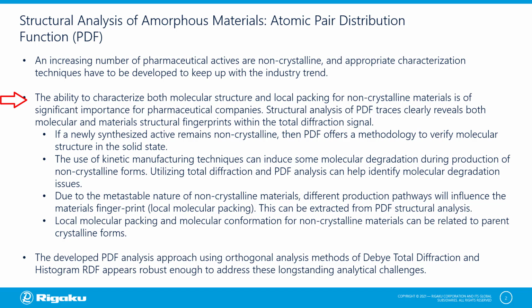Structural analysis of PDF traces clearly reveals both molecular and material structural fingerprints within the total diffraction signal. To give you some examples where this might be useful or important, for example, if a newly synthesized active remains non-crystalline, then PDF offers a methodology to verify molecular structure in the solid state. This is one of only very few methodologies that are available to elucidate molecular structure itself inside the solid state for materials that are non-crystalline or amorphous.